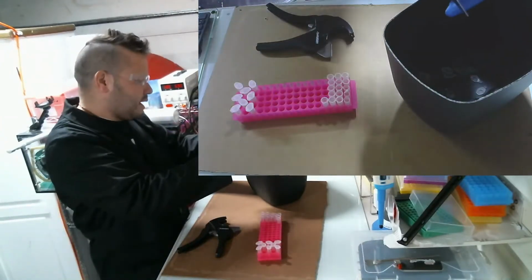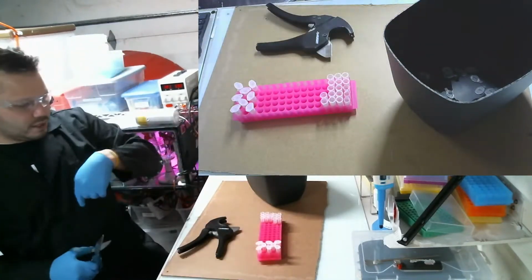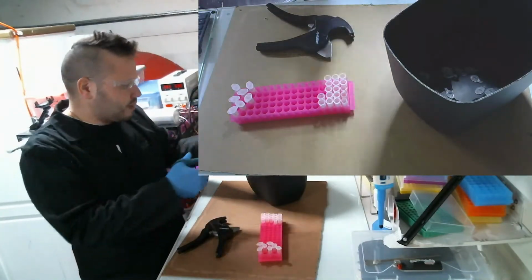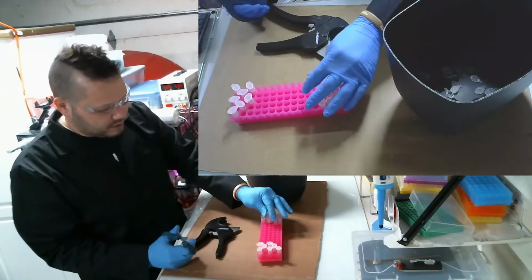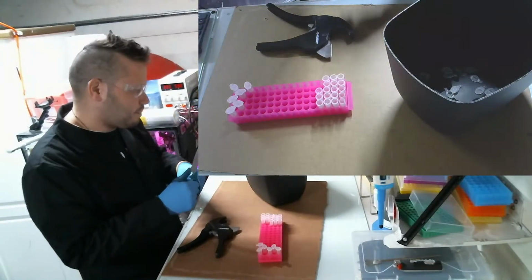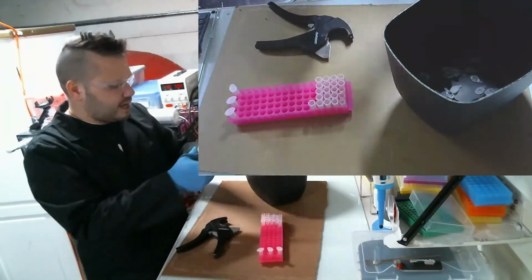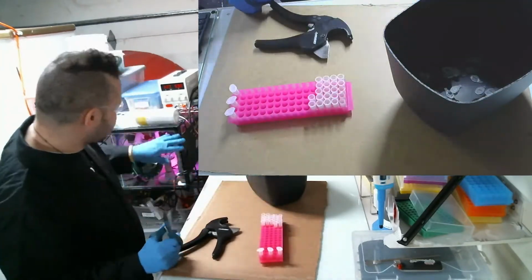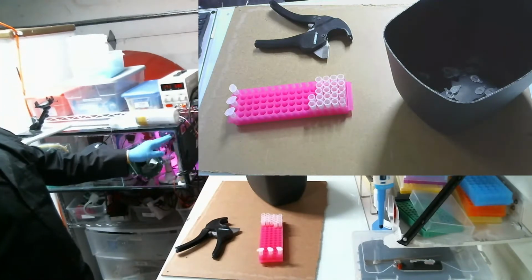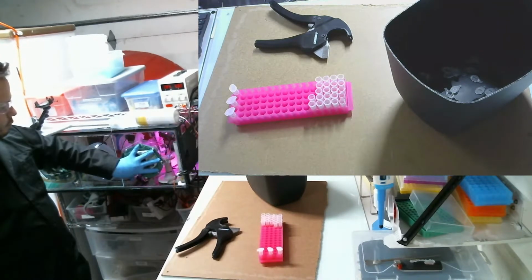Right now there's algae in there, and there's an air line that goes into the beaker that contains the algae, and it aerates it, provides carbon dioxide, and provides motion to the algae, because the algae needs to stay in motion. And the incubator, it's interesting. It's actually a fish tank turned on its side, and then there's plexiglass put across the front, and I put 2 holes where I put these gloves in here.